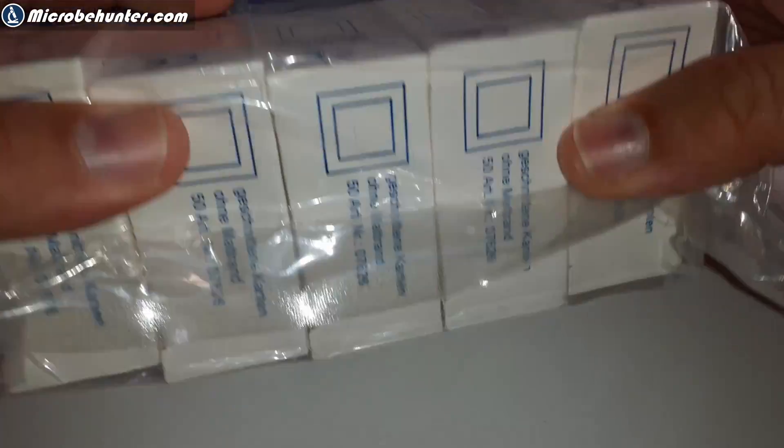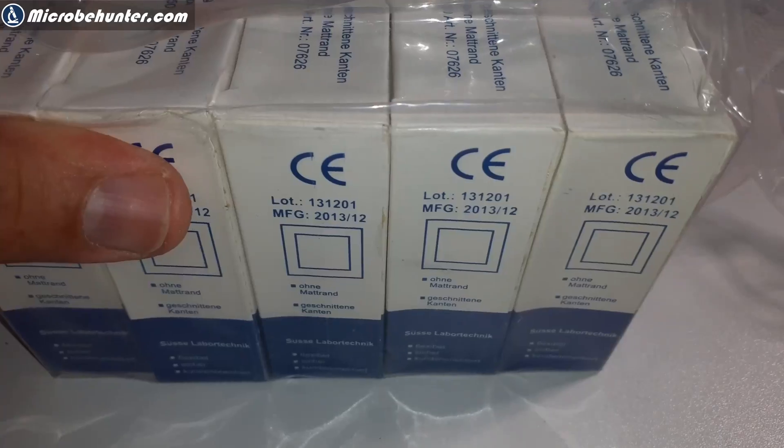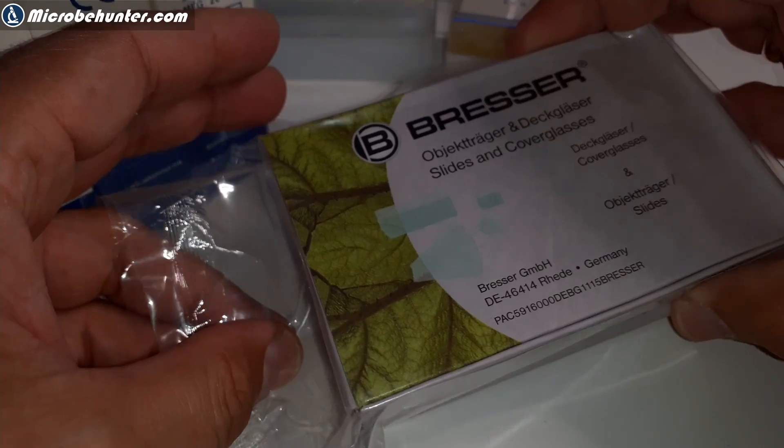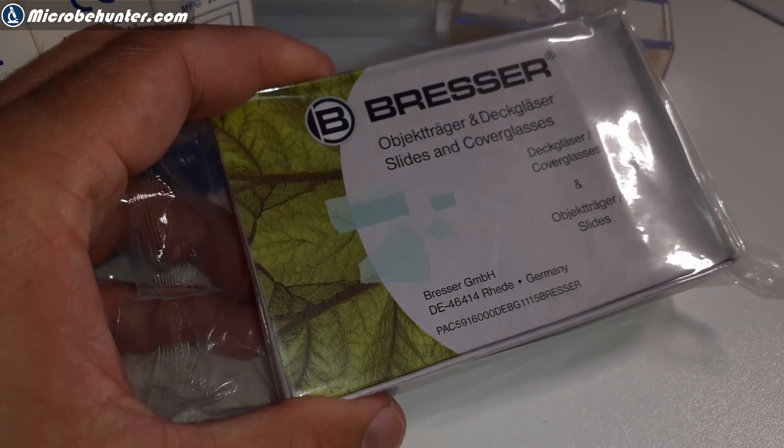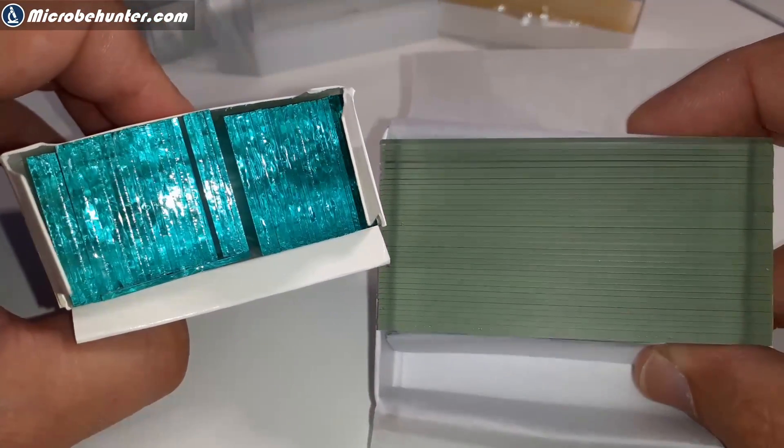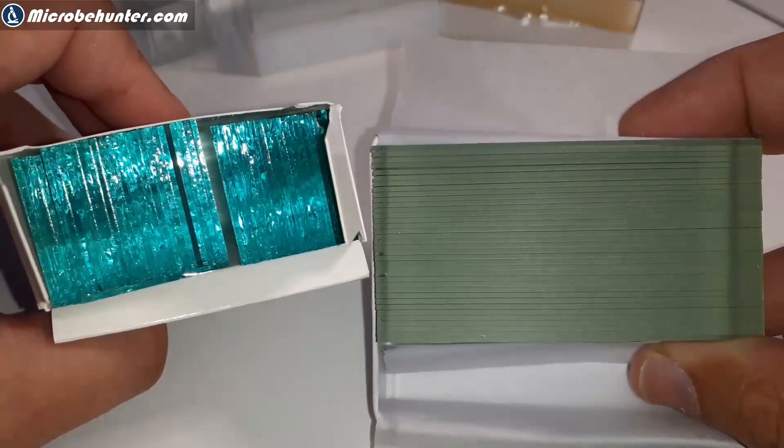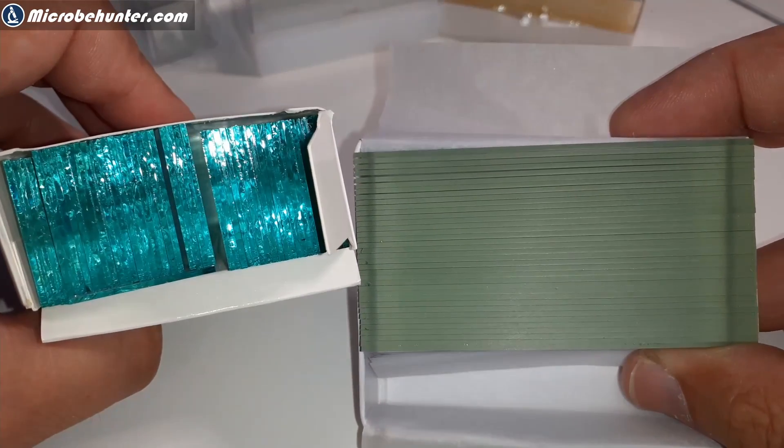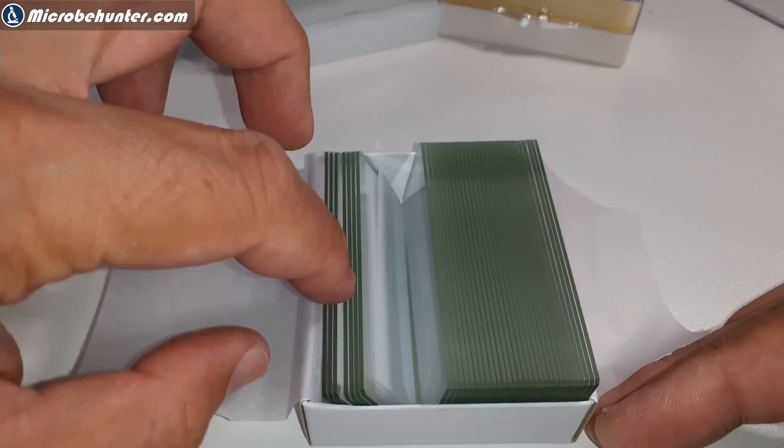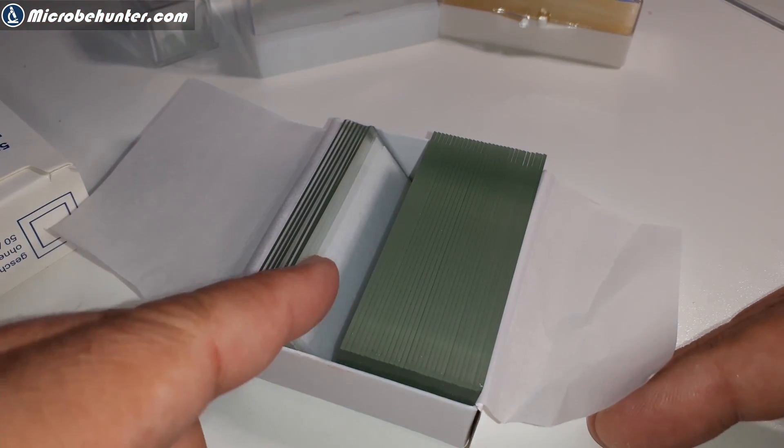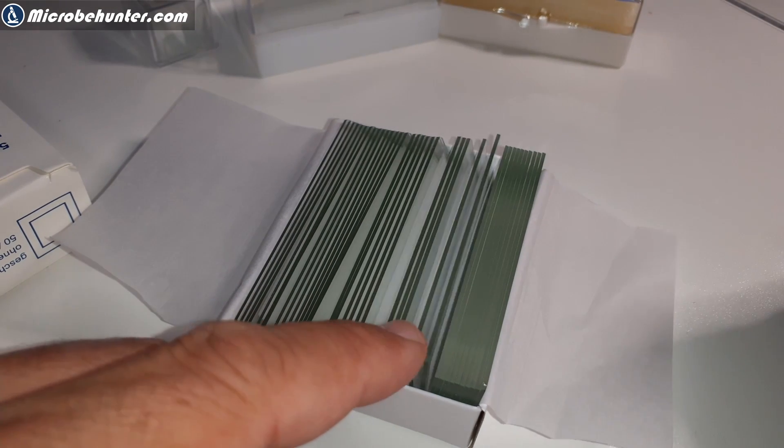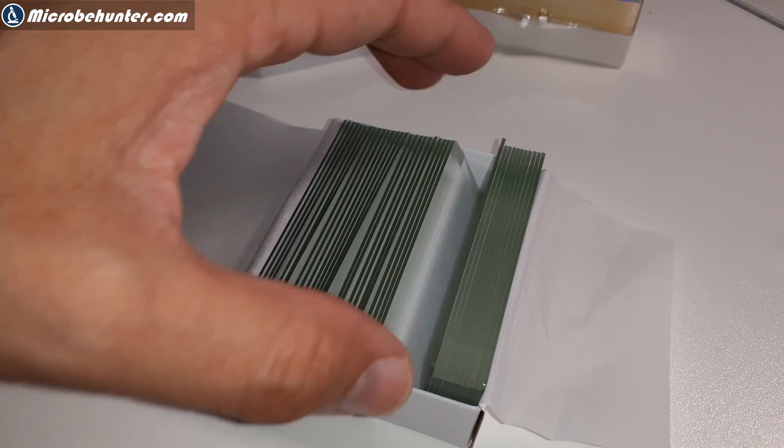I'm going to now open this pack of slides here and also a second pack. Look, here you see both of them. On the left side, you see the cheaper slides with the cut edges, and on the right side, the slightly more expensive slides with 45-degree corners and ground edges. The difference is quite visible. Those slides here are even separated by a piece of paper to prevent them from sticking together. The packaging is a little bit more elaborate here, which also causes the price to be a little bit higher.